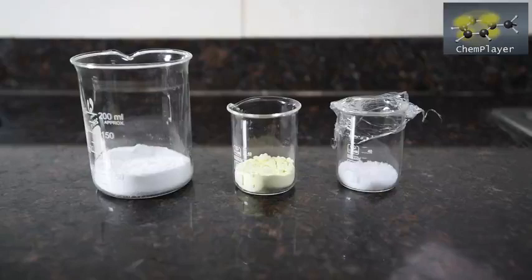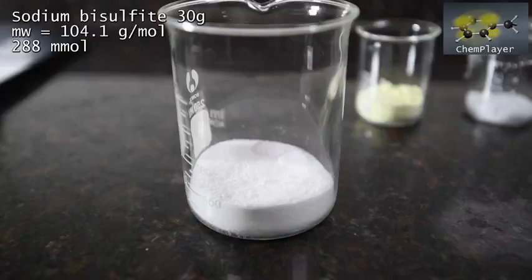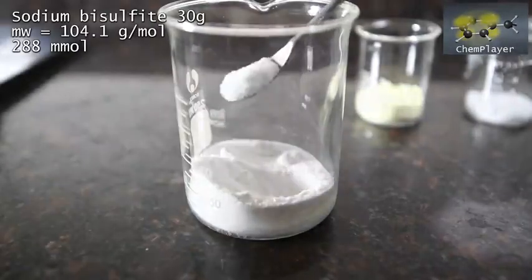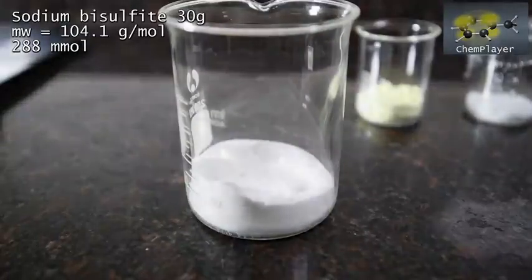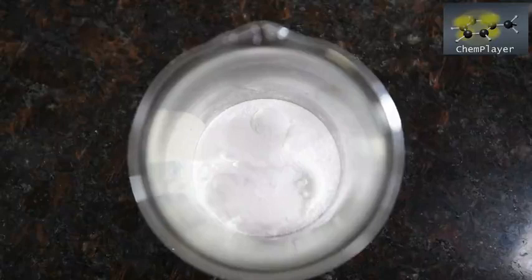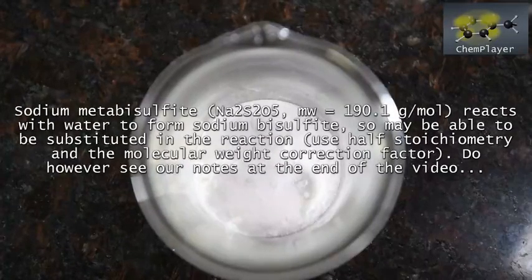Here's our lineup of ingredients for the reaction. First of all, here's 30 grams of sodium bisulfite — just a fine white powder with a faint aroma of sulfur dioxide. If you've got metabisulfite for home brewing then this should also work; just make sure you recalculate moles correctly using the right molecular weight.